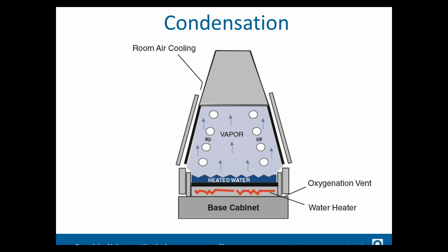The big benefit of using a fluorescent UV, other than the fact that it is less expensive and that the UV is stable, is that we can actually generate condensation. As mentioned before, condensation is the most common form of wetness outdoors, and really provides a lot of oxygen to the material. And in this case, it actually allows us to have hot air there.